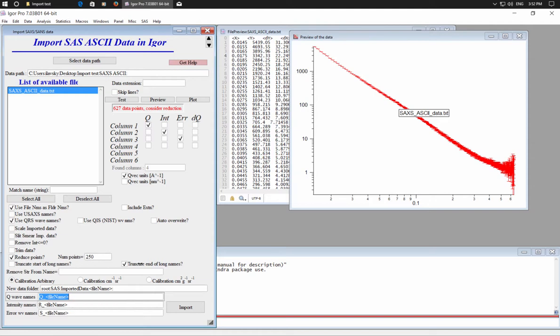So typically what happens, we truncate the end of a long name. So if this name here of the file would be too long, after you reach 26 characters or so, we just throw everything else away. Now that may not be good if most of the useful information is at the end, so you get other choices. You can truncate the start of the long name. If you do it, it will truncate the front and leave the end.